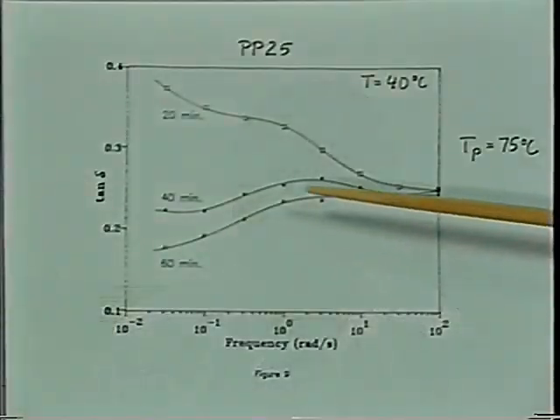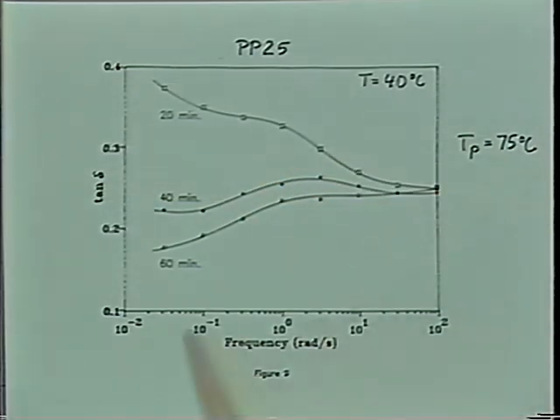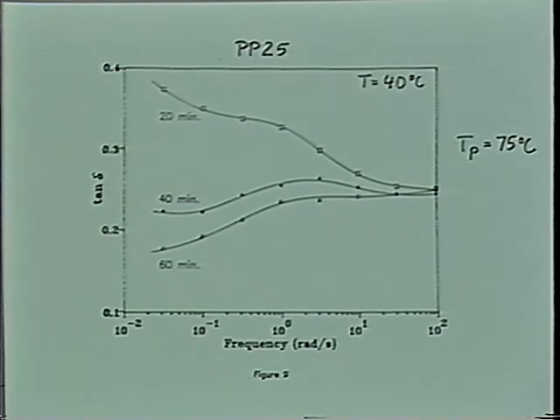When you know there's a difficulty, you can use X-ray or DSC or other tools to look at details in the crystalline structure. And here we have some difficulties. It's even more pronounced when you look at tan delta. Here I have tan delta of that sample, and it's never flat. So you can see over that frequency range, which corresponds to some size range in the material, there's some complicated morphology, and it needs some further analysis to describe what's happening.